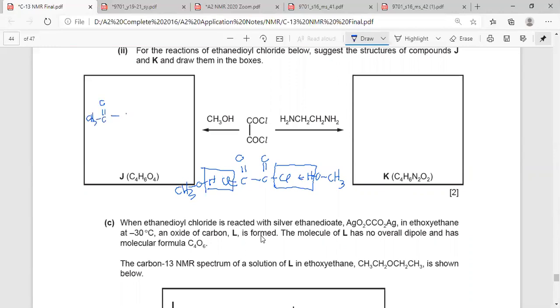Here's O here. And there's O here and CH3. You can see here 4 oxygen, 4 carbons, 6 hydrogen. Here, of course, now here is very tricky, because this is a ring. I'm going to draw it here.